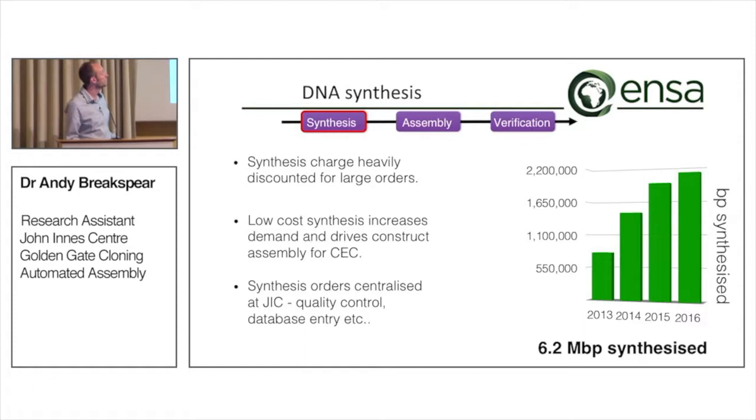So actually, it turns out it's cheaper to get stuff synthesized than it is to be cloning in the lab, to be doing the PCR and the resequencing. It's better off that you focus your time elsewhere. So we've done quite a bit of synthesis, and we're really pleased with letting the company take that part.